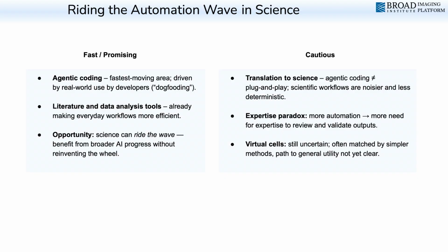Some areas like virtual cells still feel very early to us. The ideas are powerful, but in practice, simple models seem to be performing better. We're still figuring out what is genuine, robust progress out there for tools like that.